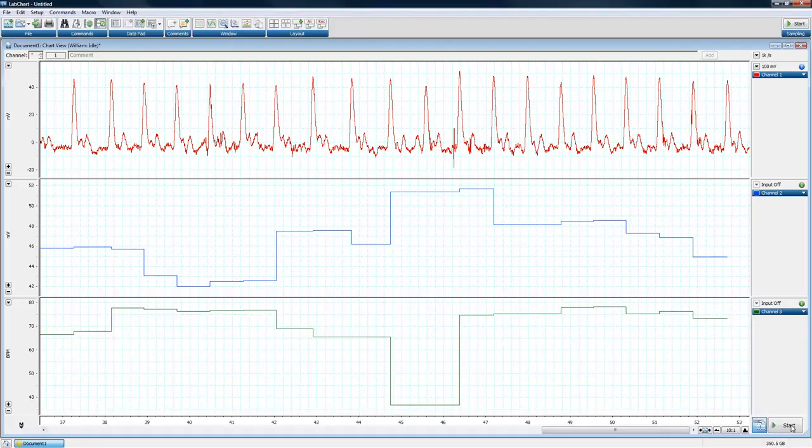So some of the other options we have here, that's really all the y-axis options that we wanted to talk about. Some of the other options we have here are to change some things about the x-axis. So what we're going to do right now is talk about some of the other chart view options. Namely, we're going to talk about the x-axis compression we have here.